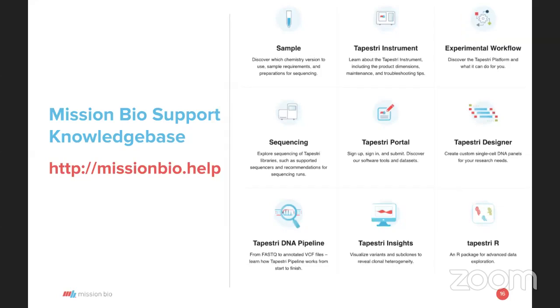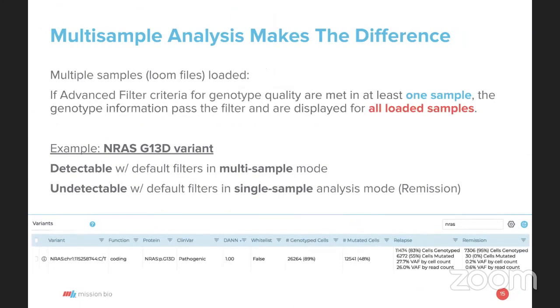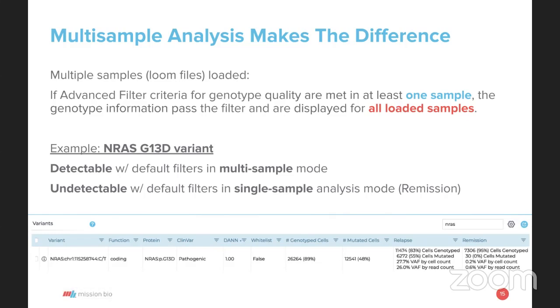Okay. And then that was really cool to see how you could look at the variants that you care about in your last slide. And so the variant was filtered out because it was very low frequency, but what if it was filtered out because it was low quality? Could you assess those other parameters or figure out why it was filtered out in the first place?